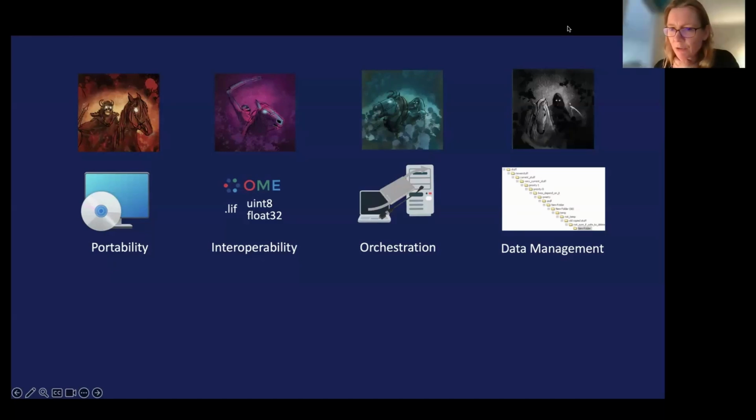There's also a question in the chat. What is the difference between Arkitekt and ICY, the ICY software? I don't know if you know that. Yep, I know ICY. ICY also allows you to have ImageJ and little blocks itself and run these analysis tasks, which is super cool. And it also allows you to have Conda environments.